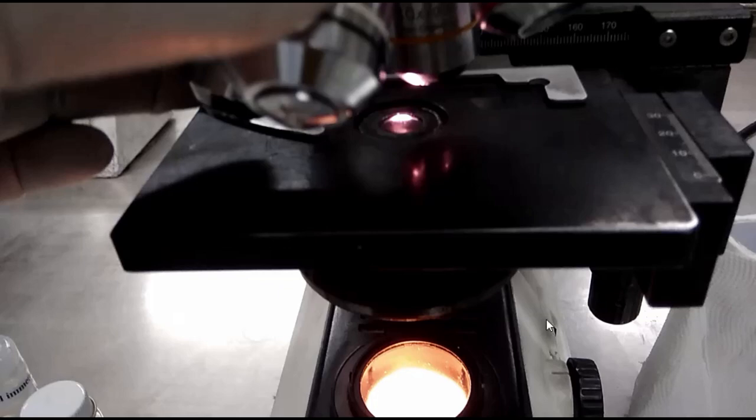The microscope stand is the main framework of the microscope, consisting of the main tube, body tube and arm, which supports the main tube, body tube and the stage. Then a substage and a foot or base that supports the whole instrument, which rests on it. This one is the base or foot.